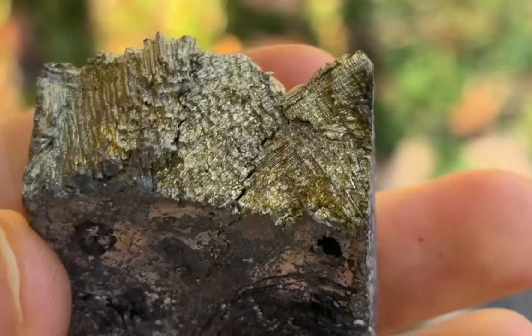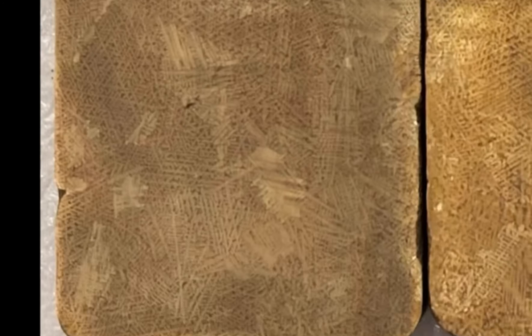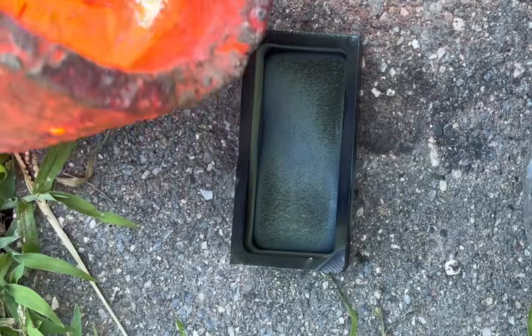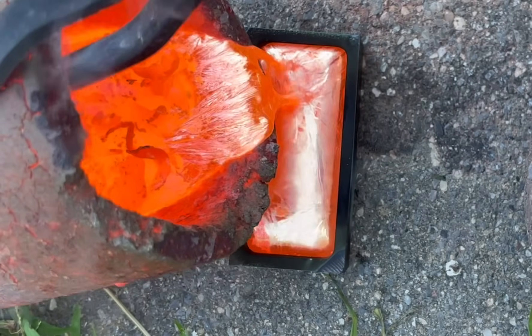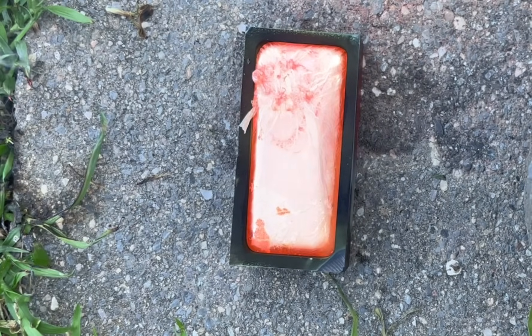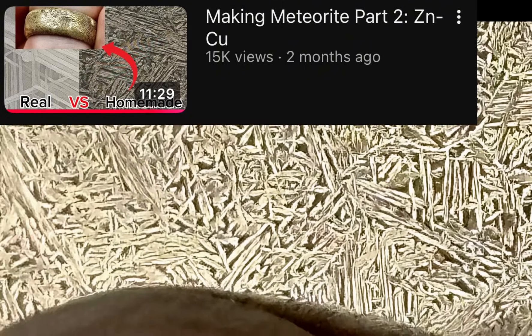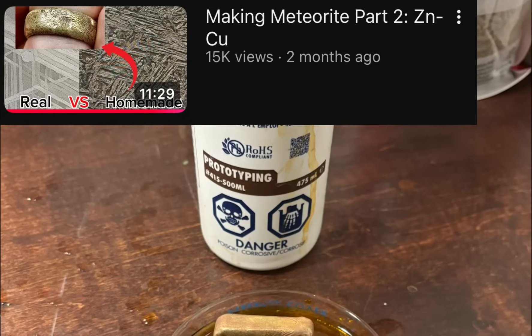So if you're interested in making anything with this dendritic brass for the goal of aesthetics, this is pretty much everything you need to know. While the air-cooled dendrites and grains are smaller, I still think they look spectacular. Essentially you don't need a furnace to attain this microstructure — all you need to be able to do is just melt metal. I hope to see some dendritic brass sculptures out there in the future, because I think it's really cool looking, especially when you have an appreciation for the metallurgy. Don't forget to check out the other video in this series where you can learn a little more about the microstructure of brass and get a much more technical explanation on why dendrites form.